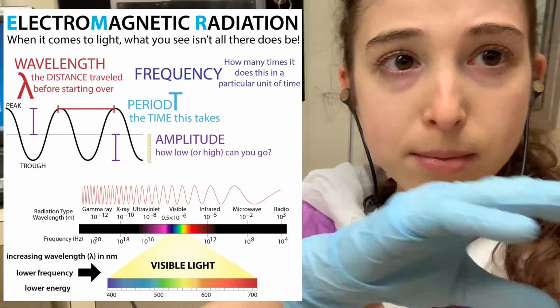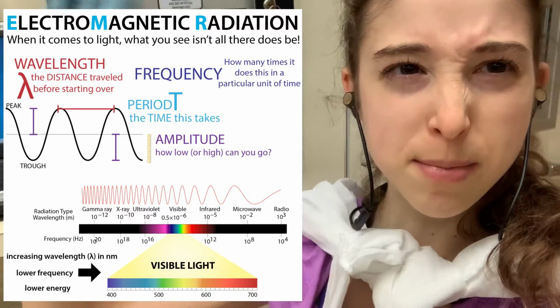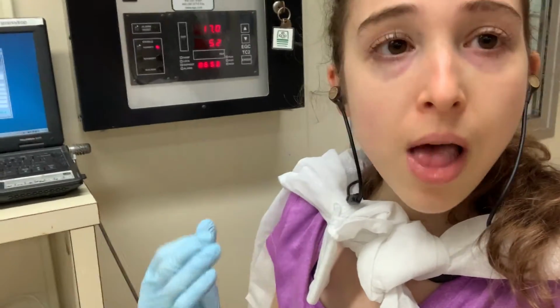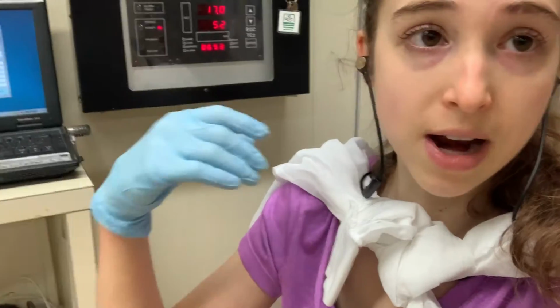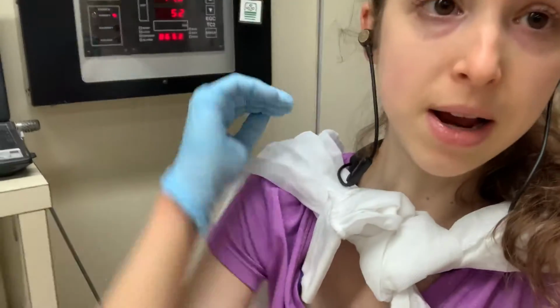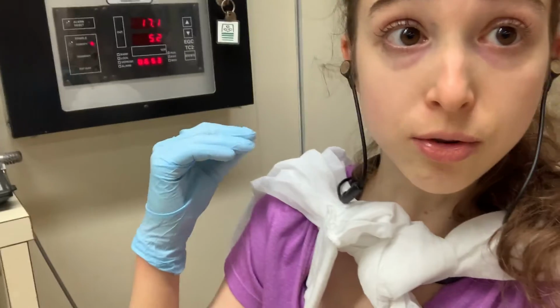So with the rainbow, like Roy G. Biv, with the V being the violet, if you go even past that, even higher frequency, you get to ultraviolet light. We can't see this with our eyes, but molecules can interact with it, just like the molecules in my shirt can interact with the visible light. A lot of biological molecules, including DNA and RNA, absorb light in this ultraviolet range. So they're absorbing this really high energy light.